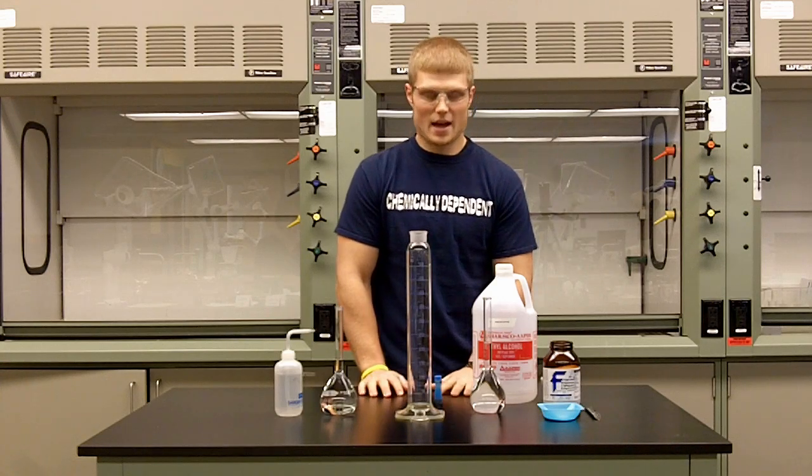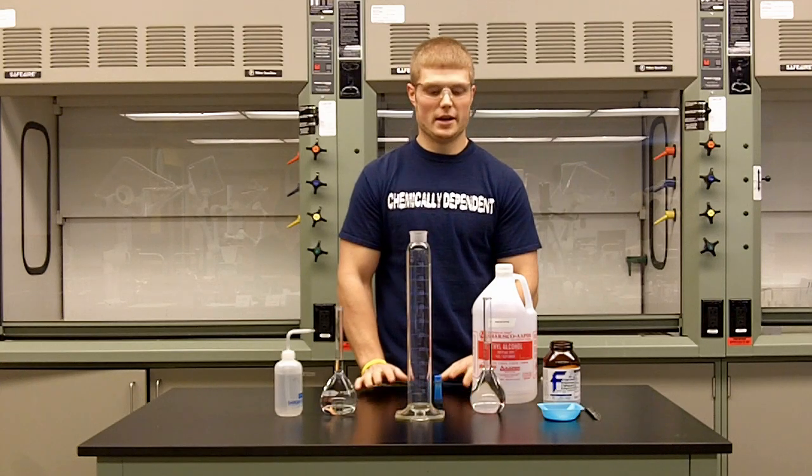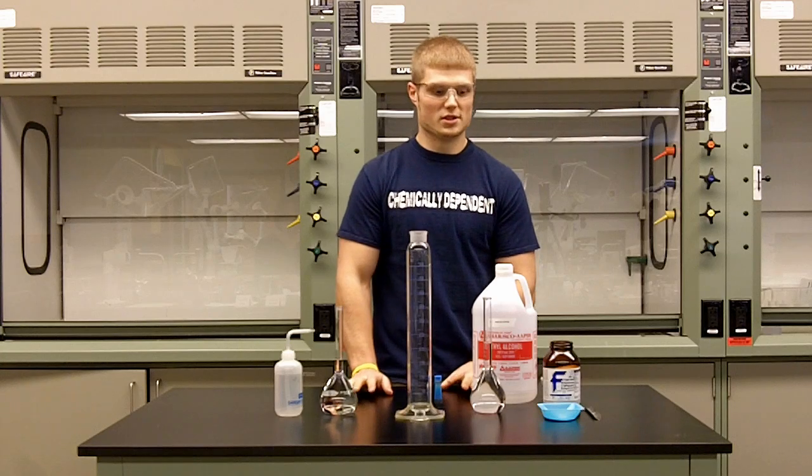Hi, my name is Dennis, and today I'm going to show you how to separate water and ethanol using salts.